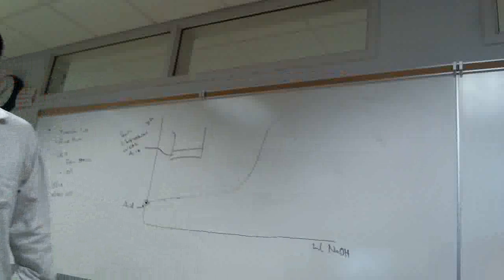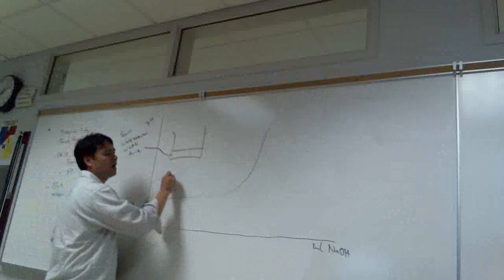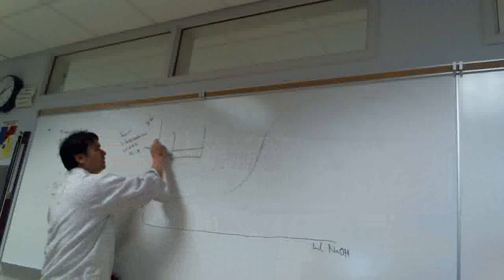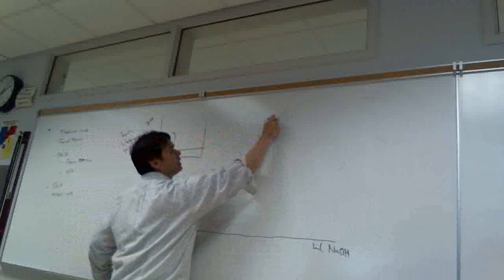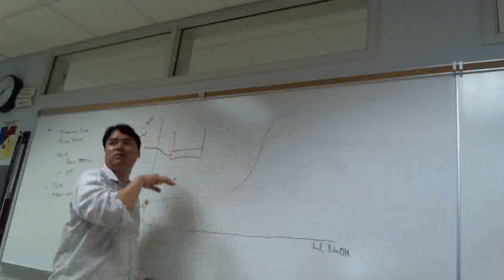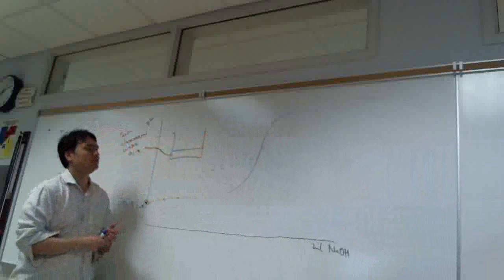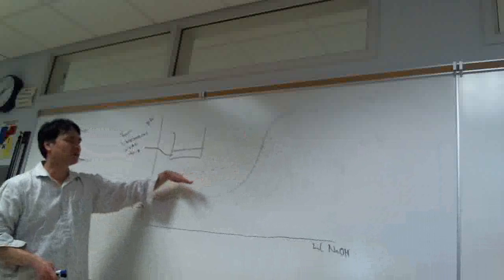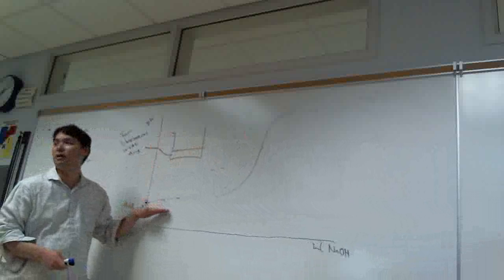But if you make it too dilute, like this, then this rise in pH here isn't going to be as pronounced. If we make it way too dilute, you might not see much of an equivalence point. This first wave here is the equivalence point. And so to make this first wave as pronounced as possible, we want to make sure we start at the lowest pH possible.